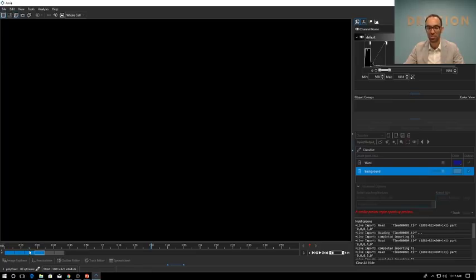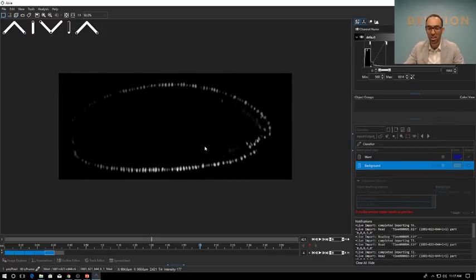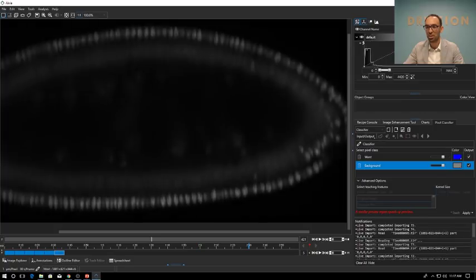So it's probably going to try and finish the 3D rendering before it lets me go into the 2D mode. So there's a few kinks for us to work out, but we're looking to make this a very, very quick tool. It is already very quick, but it can be even faster and more feature rich, and that's what we're going to be working on.